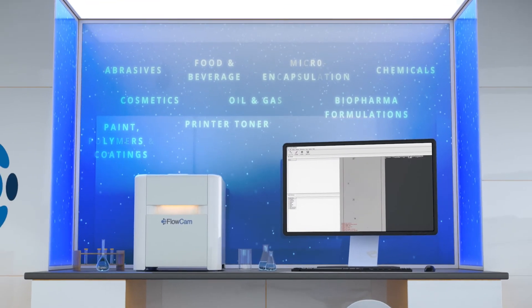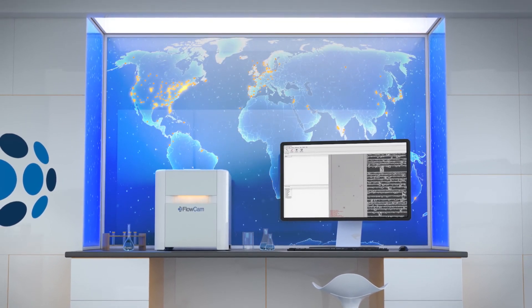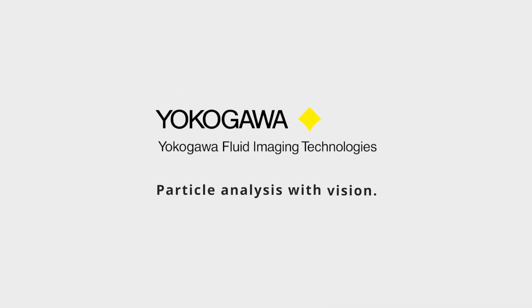We're taking the mystery out of particle analysis and bringing our vision to the world. The FlowCam by Yokogawa Fluid Imaging Technologies. Particle analysis with vision.